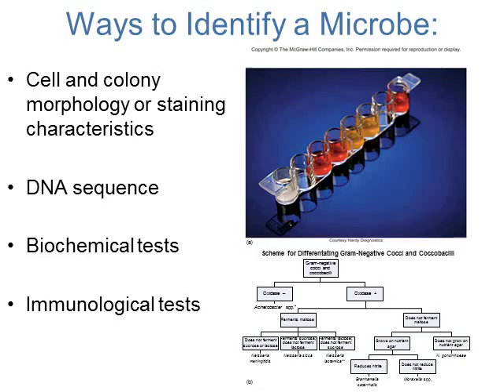Identification of a microbe. Once you have your pure culture, you've isolated it, you want to identify what that bacteria is. We usually use this when you want to identify the bacteria species that is causing an animal or human to become sick. We can identify microorganisms based on their cell and colony morphology. So you can look at the colony, write down what it looks like, if it has any color to it. You can take a sample of your colony and stain it, so you can use simple staining, you can use gram staining, some of those differential stains we talked about.